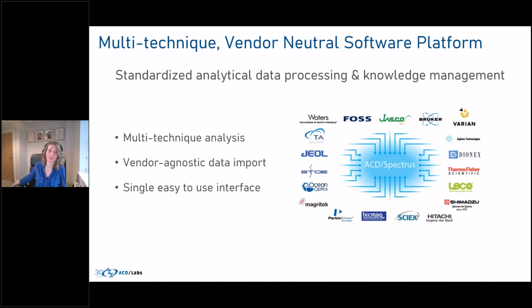For academics, Spectrus Processor offers quite a benefit in terms of learning for students, so it can support students learning about structure interpretation and structure verifications, particularly with NMR. It's really useful from that aspect. For research scientists, the software can help accelerate your decision making with regards to what happens next in your reactions.